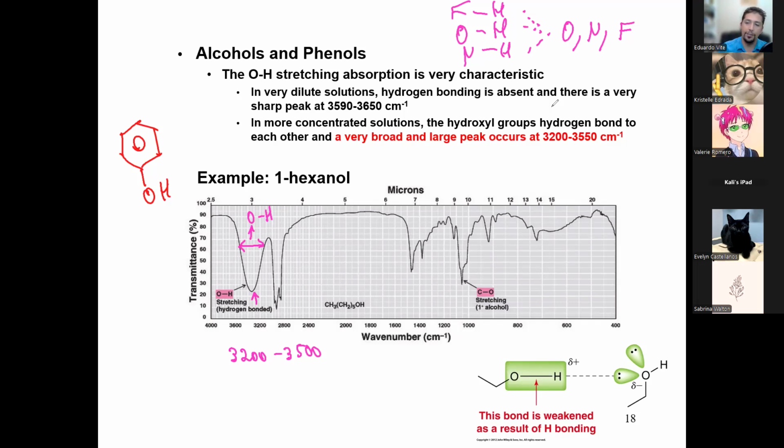All right. And then, in general, if we have an OH, it's bonded to a carbon, right? So it's C-OH something. This carbon-oxygen bond is also polar and it also vibrates. So we do see that signal at around 1100. Carbon-oxygen single bonds are usually between 1200 and 1000, but often around 1100. Again, some people would consider this the fingerprint region, so sometimes they don't look for it, but you should know where they are because ethers are also carbon-oxygen bonds and they show up in the same region. So you start seeing the patterns of where the bonds are located in terms of wave numbers. So any questions?